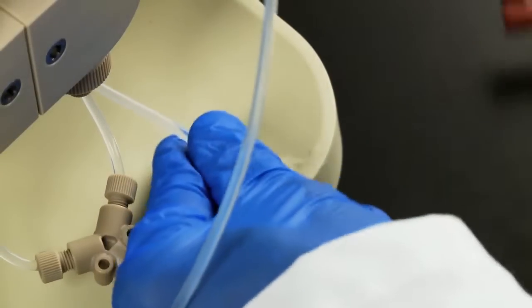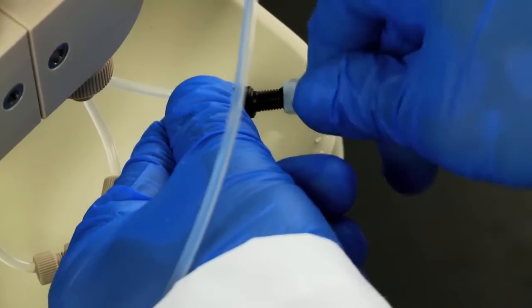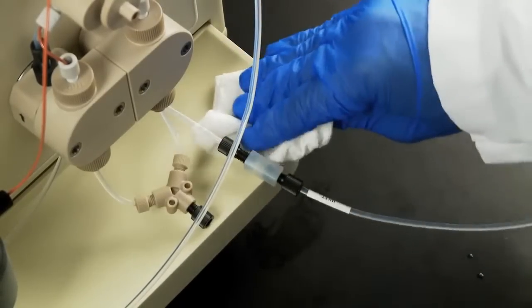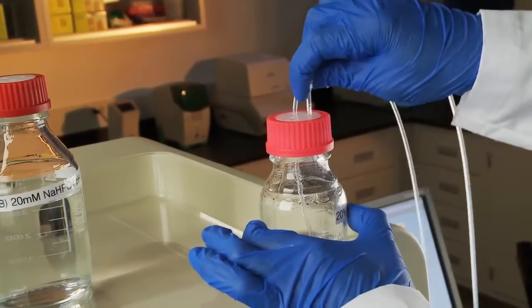Detach the syringe and the adapter from the priming line and attach the outlet line with the union. Clean up any storage alcohol that may have spilled during priming. Place the end of the outlet line into the pump head wash reservoir.